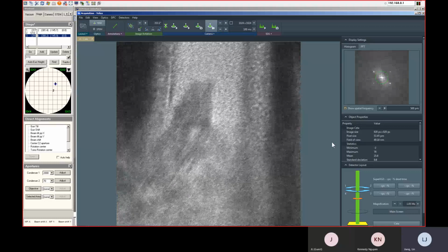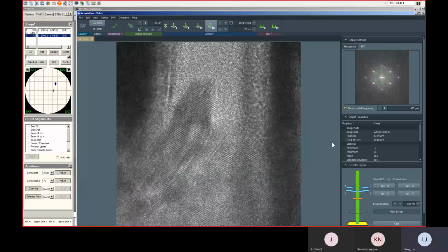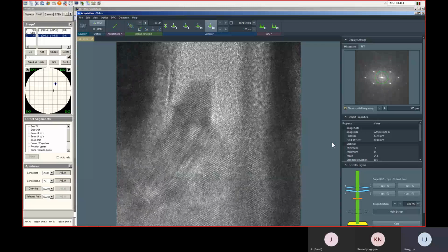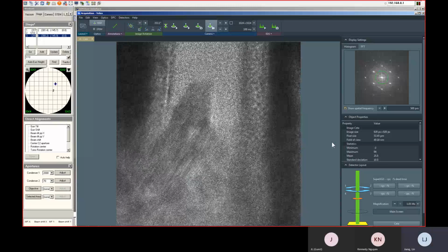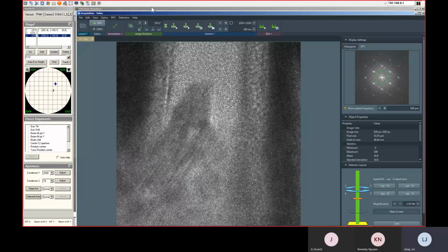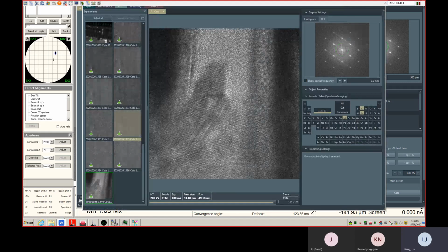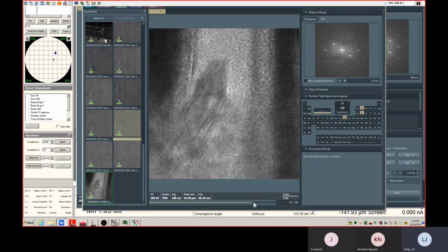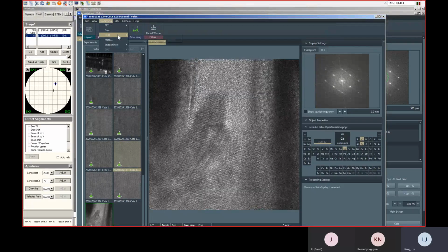You see there's some vibration there, because someone just closed the door. But what I mean is, if you have a lot of drifting, it's better to use a smaller, shorter exposure time. And then here, this is your data. You get 100 frames. You see a lot of drifting, right? And then you can go DCFI.